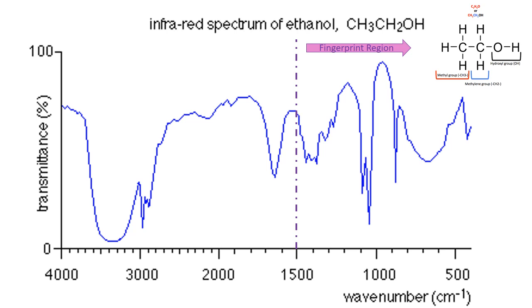I find it really useful sometimes to sketch out the structure I'm looking at the spectrum for, because it means I can know which groups I'm going to be looking out for, which functional groups. I've also identified the fingerprint region in all these slides.